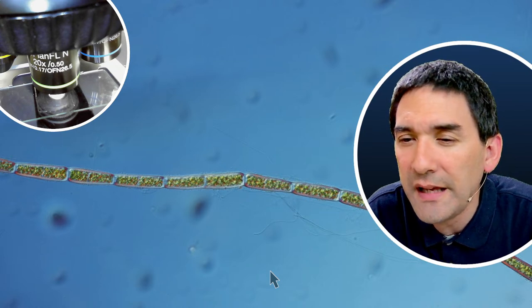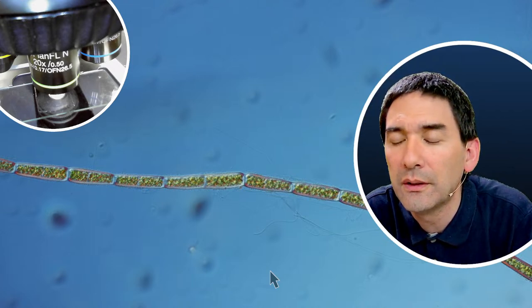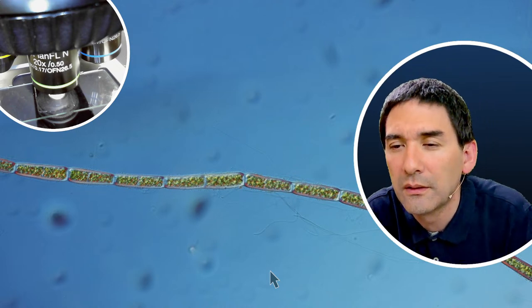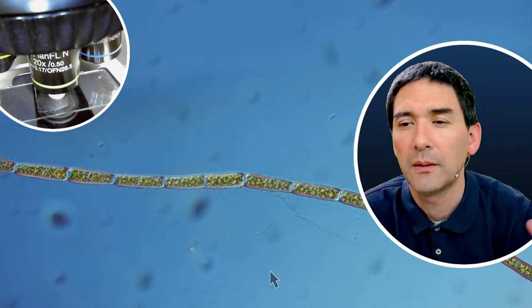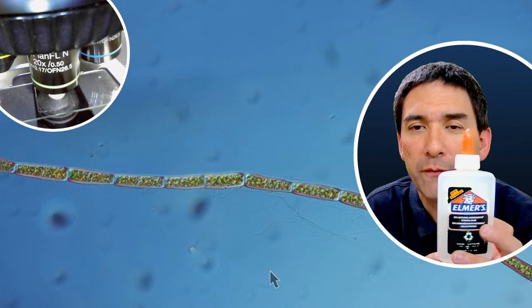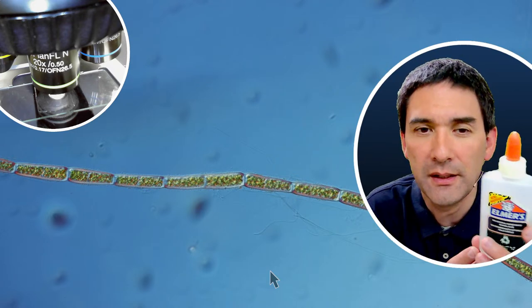Do you use the PVA glue? Neat. What I do is, the PVA glue that I have here, one of the reasons why I use this, especially for algae and for water organisms, is because it's water-based and therefore it does not dry out the specimen quite as much.